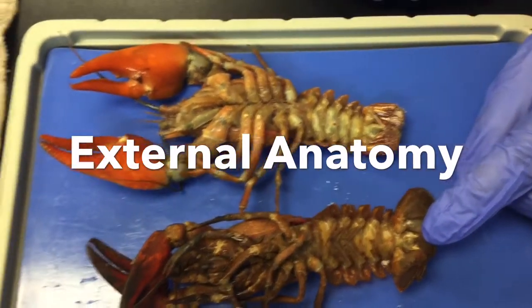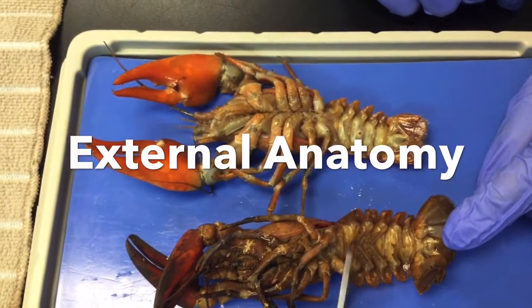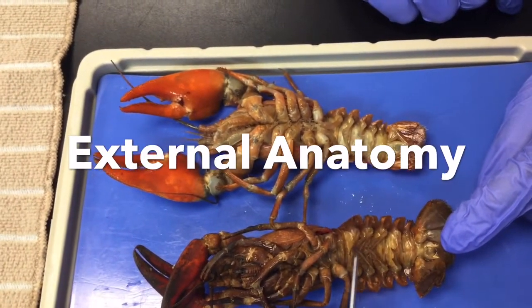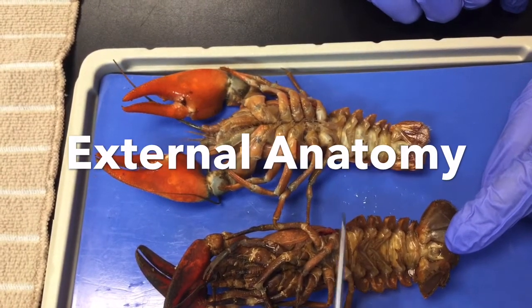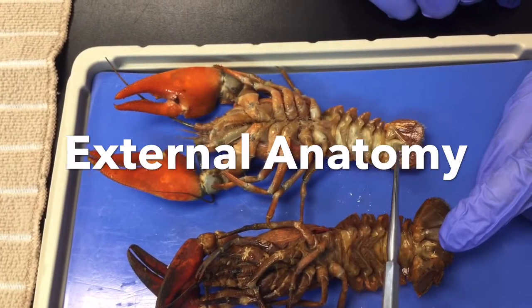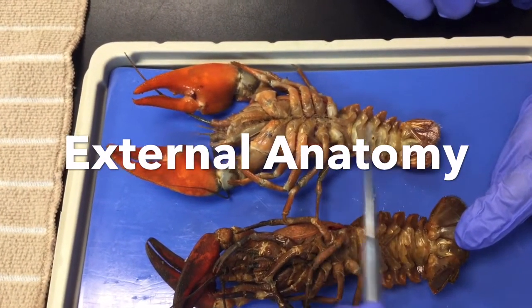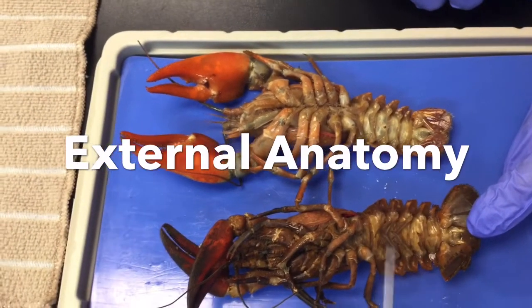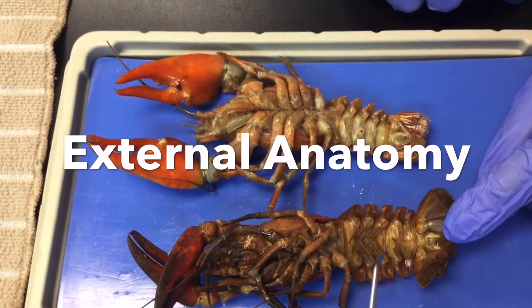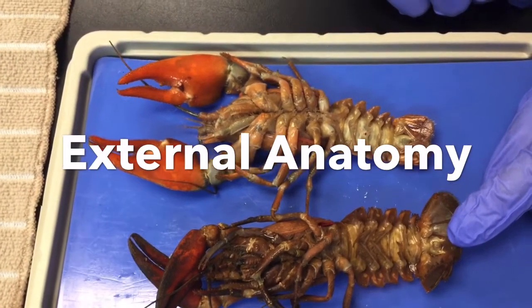You can see the swimmerets here and here. Notice they're different. The female swimmerets are all the same size, and the male swimmerets, the first two are very, very large, and then they progressively get smaller. So that's how we know. Here's a girl, and here's the boy. So you can go crayfish catching and determine, do you have female or male. So that's our first external view.